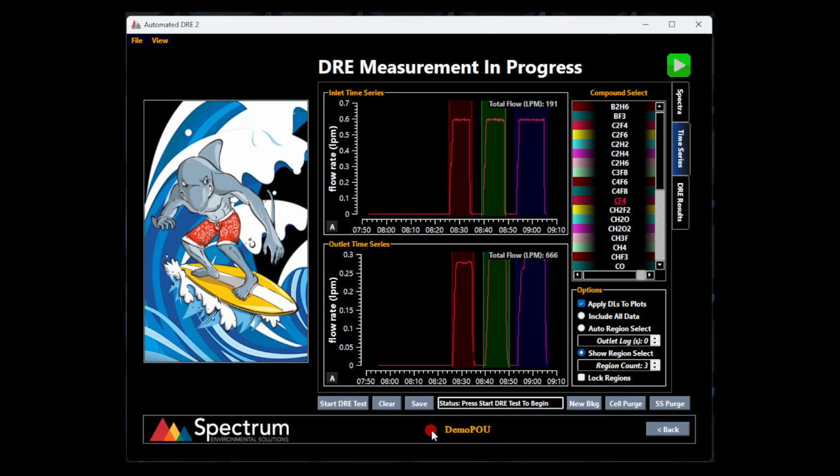In part three, we're going to take this one step further, and we're going to show how we can take a set of data that we've reprocessed in New Wave, maybe we've made analytical changes to our methodology and cleaned up some of the concentration results. And then we're going to import those into the DRE program, and then step through these pages to produce the final DRE results in the file formats that we looked at in part one.